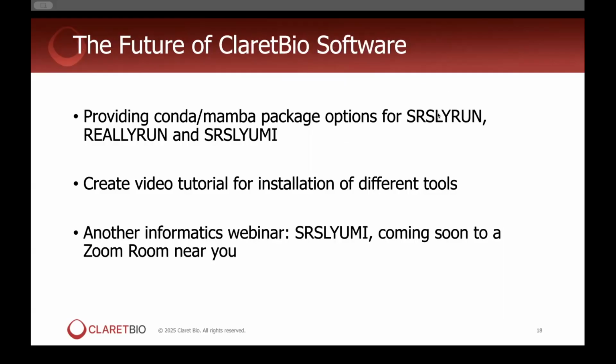And so that basically covers all you really need to know regarding how to run srslyrun and the files that are generated, as well as how to double check to make sure that everything was run properly.